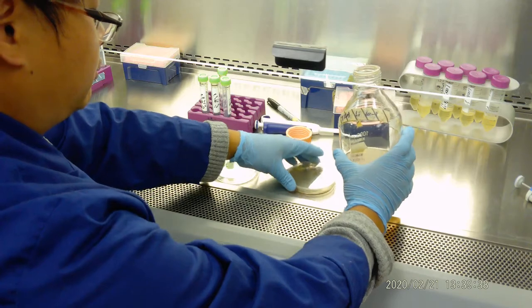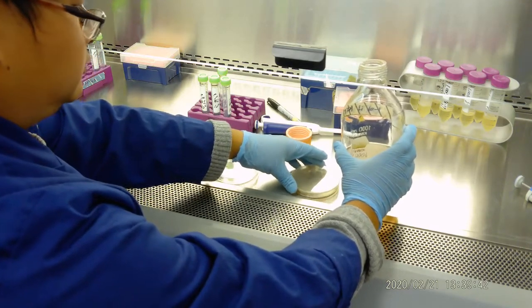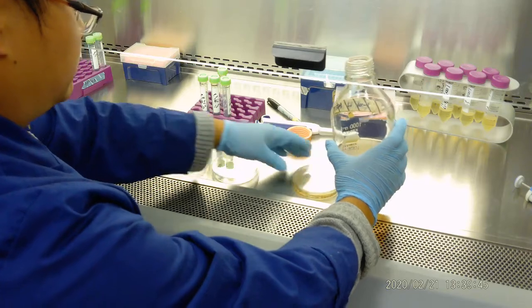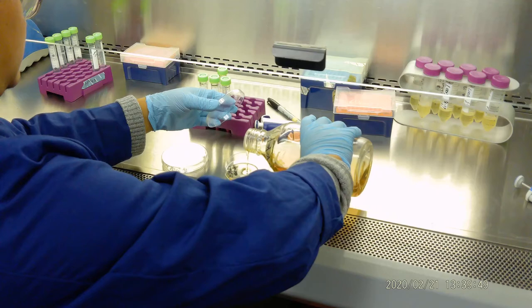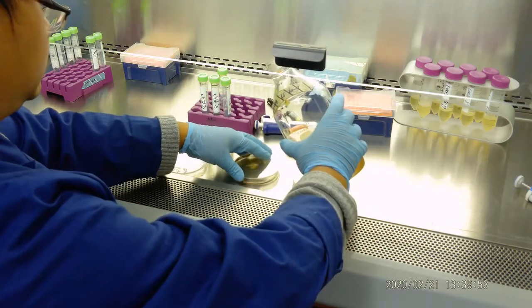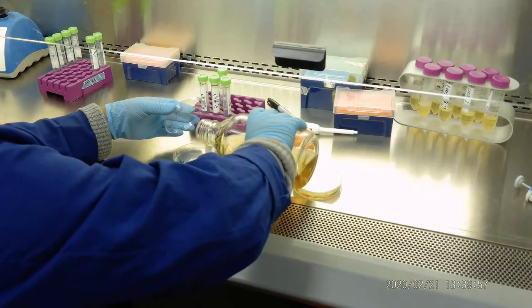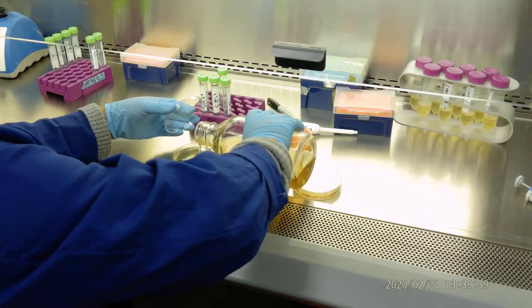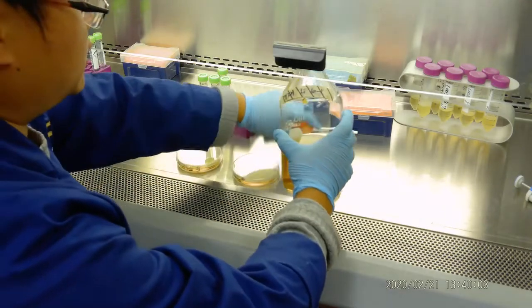And after we pour, we will stir it. So Lee, take a picture right here, we stir it. We stir it a little bit. Then we add a second one, and we mix it. It will solidify really quickly. Then we add the last one. We mix it. Okay? Very gentle.